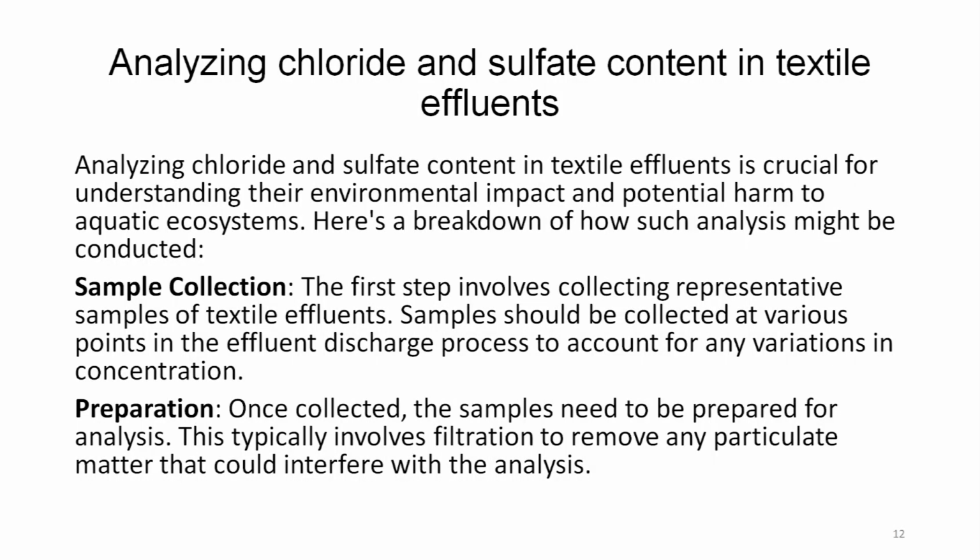Now, let us see how sulphate and chloride are analyzed in textile effluent. Analyzing chloride and sulphate content in textile effluent is crucial for understanding their environmental impact and potential harm to the aquatic ecosystems. Here is a breakdown of how such analysis might be conducted.